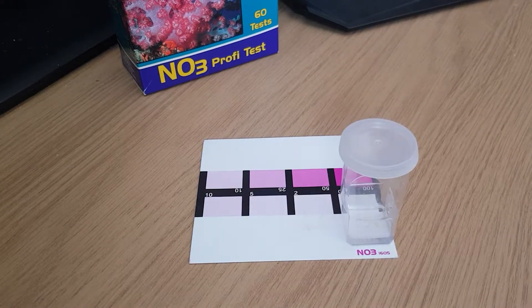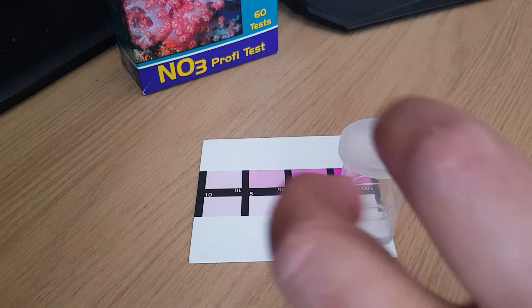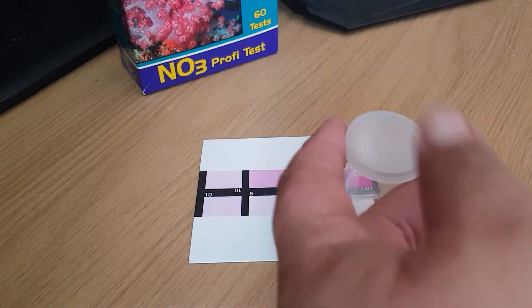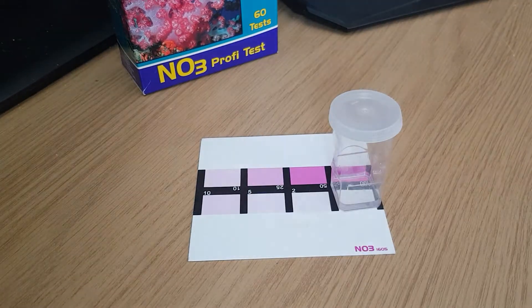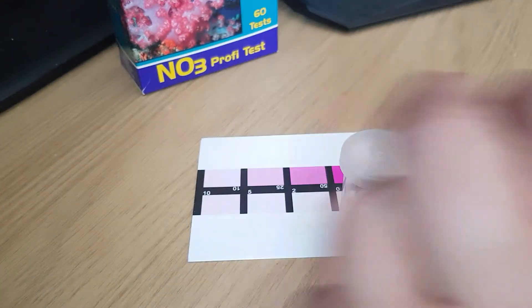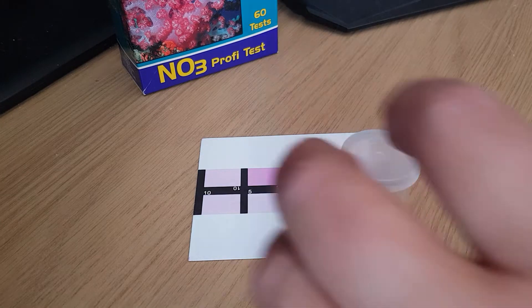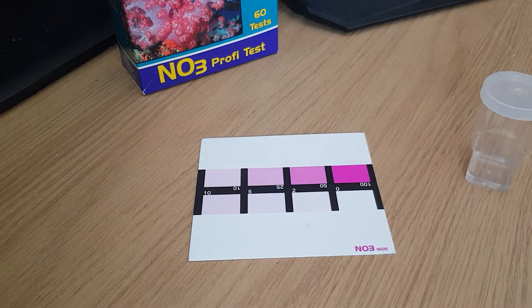Three minutes later and as you can see, that is clear — so that's a zero. But for a tank that I'm ghost feeding, I think that's ready. So let's test it till.